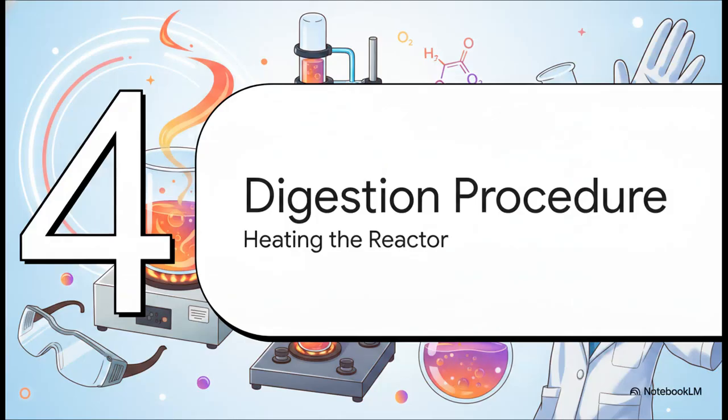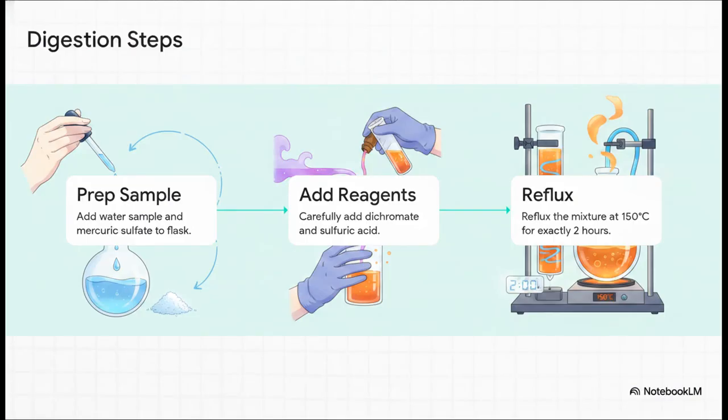Section 4. The digestion procedure. Heating things up in the reactor. This is where the chemistry truly happens.